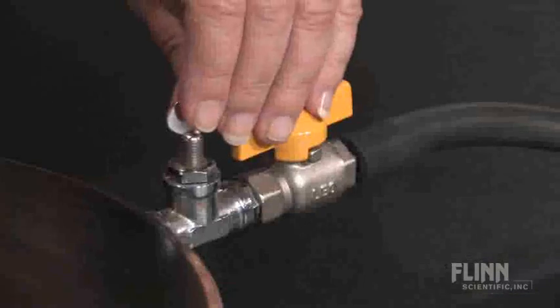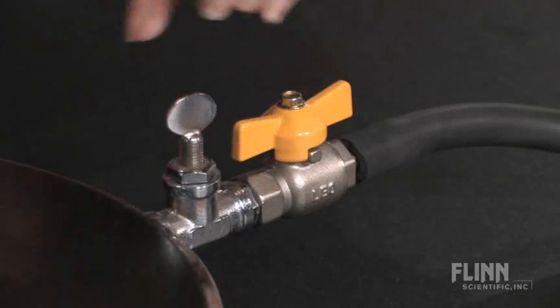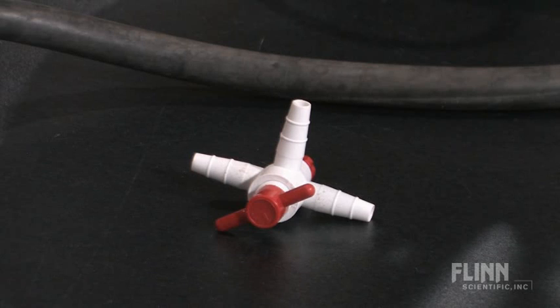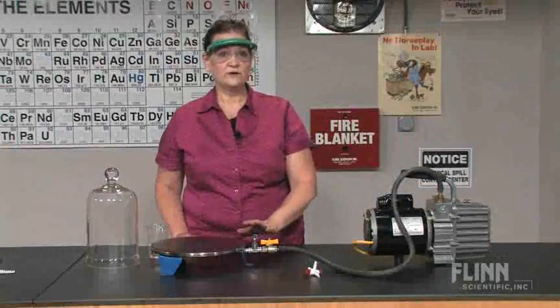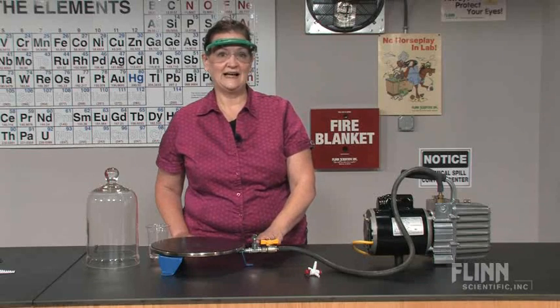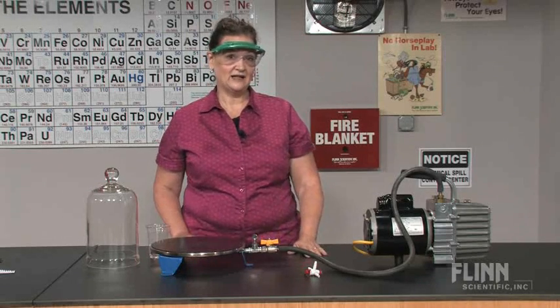You need to have a way to vent the system, and this vacuum plate has a valve for that. If you don't, you may need to use a three-way valve and use two pieces of tubing. Before you turn a pump off when it's running under vacuum, you must vent it to the atmosphere, otherwise the oil may back up in the chamber.